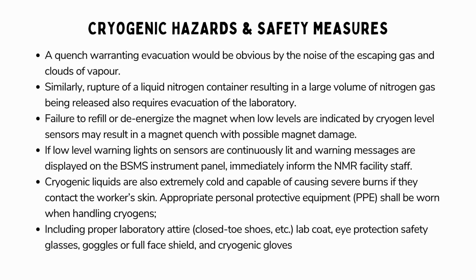Neglecting to refill or de-energize the magnet, indicated by cryogen level sensors, may lead to magnet damage due to a magnet quench. If the low-level warning lights on the sensors are continuously on and warning messages are displayed on the BSMS instrument panel, immediately inform the NMR facility staff.